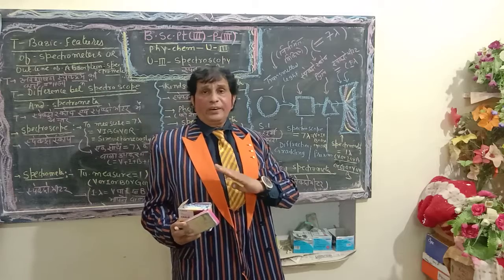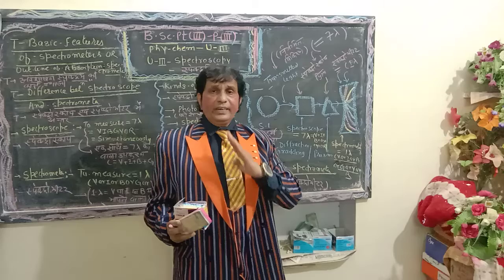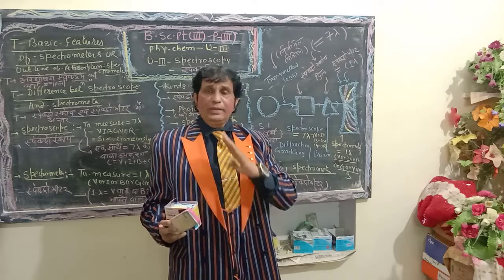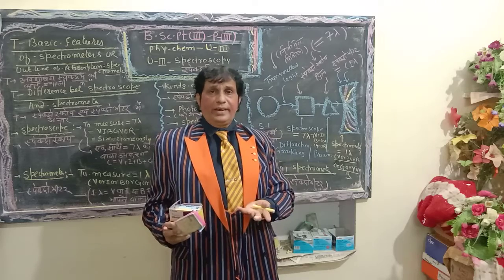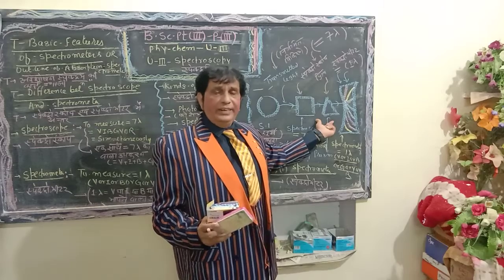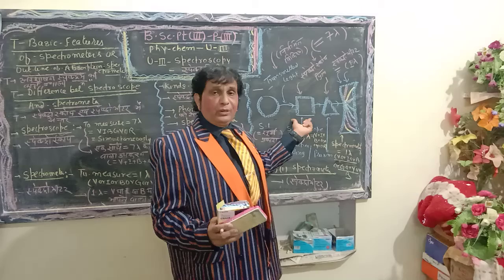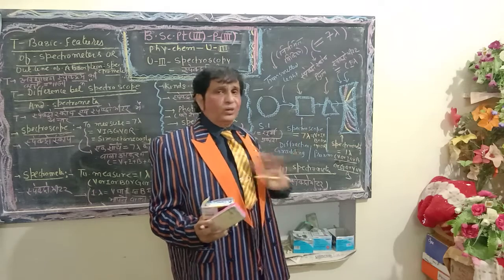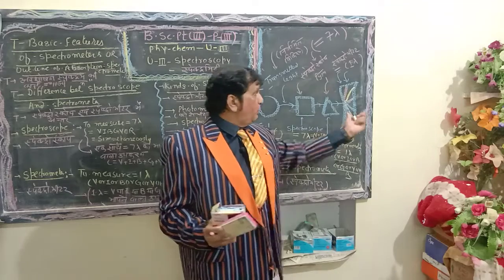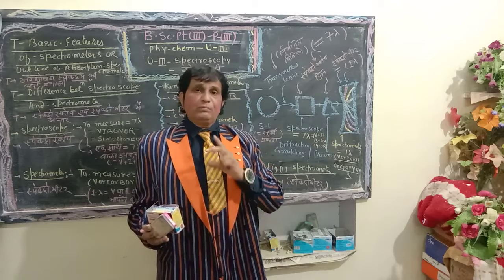Dear students, this is the fundamental difference between spectroscope and spectrometer. Once again, I repeat: a spectroscope measures 7 lambda, VIBGYOR, simultaneously. On the other hand, if a prism or diffraction grating is connected midway in the spectroscope, then obviously, there is no doubt, only one color and its lambda will be recorded and produced on the photographic plate. Such a device is known as a spectrometer.